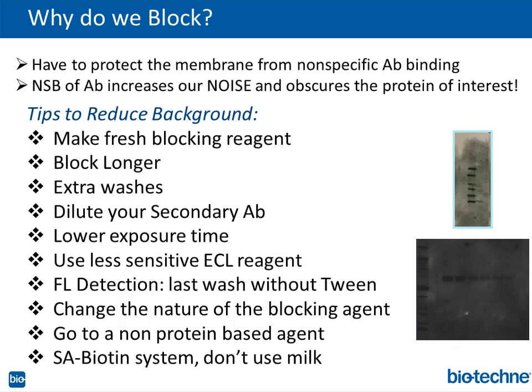Go to BSA. Second thing is, if you're making non-fat dry milk, make sure you fully stir and dissolve that blocking agent with a magnetic stir bar. A lot of people might just take a 50 ml conical and shake it. I would absolutely dissolve it, because if it's not fully in solution, it's not going to fully block and be solvated to fully penetrate that membrane and get you good blocking. Of course, you may want to block longer.